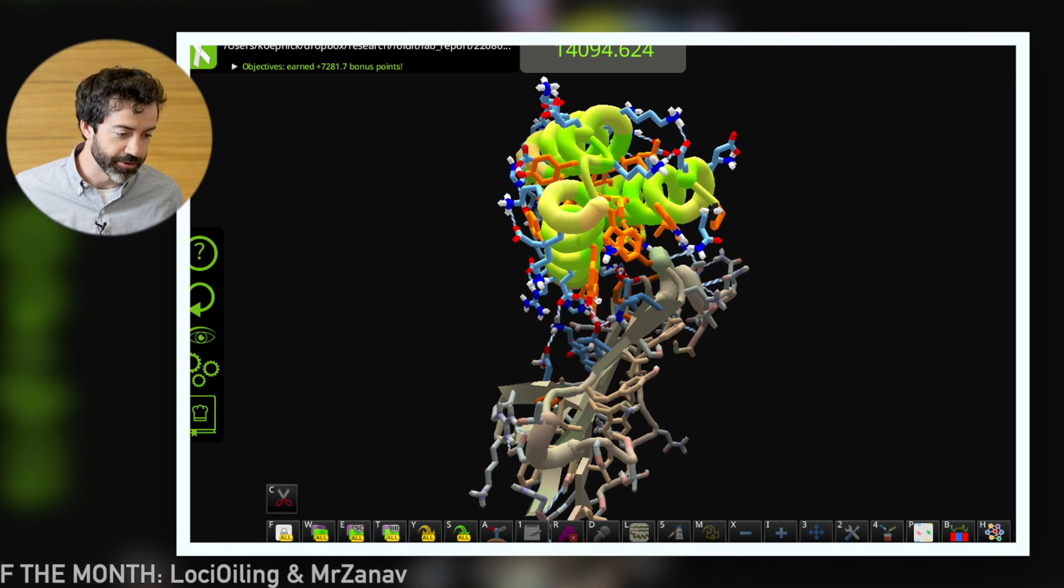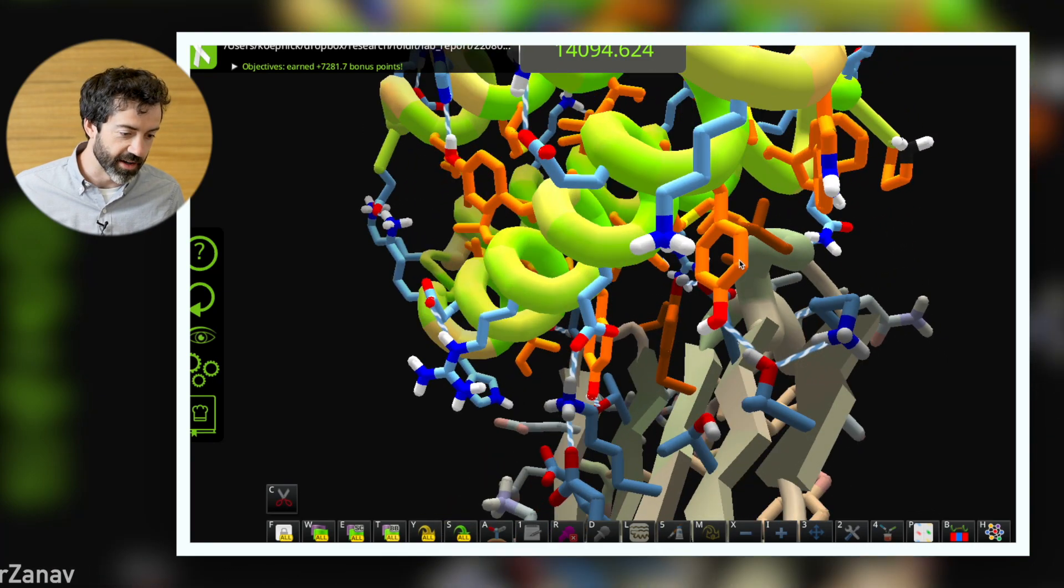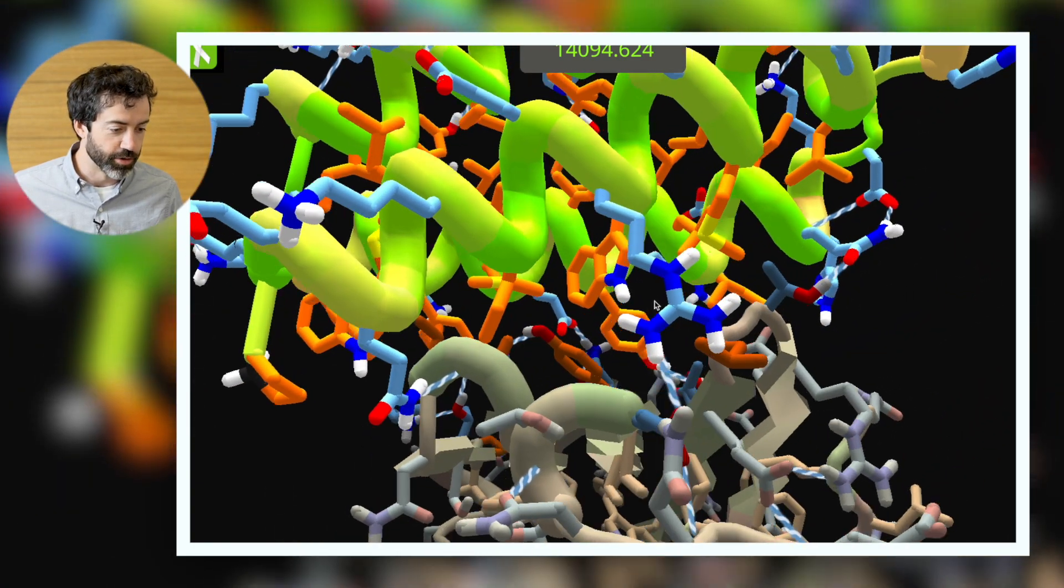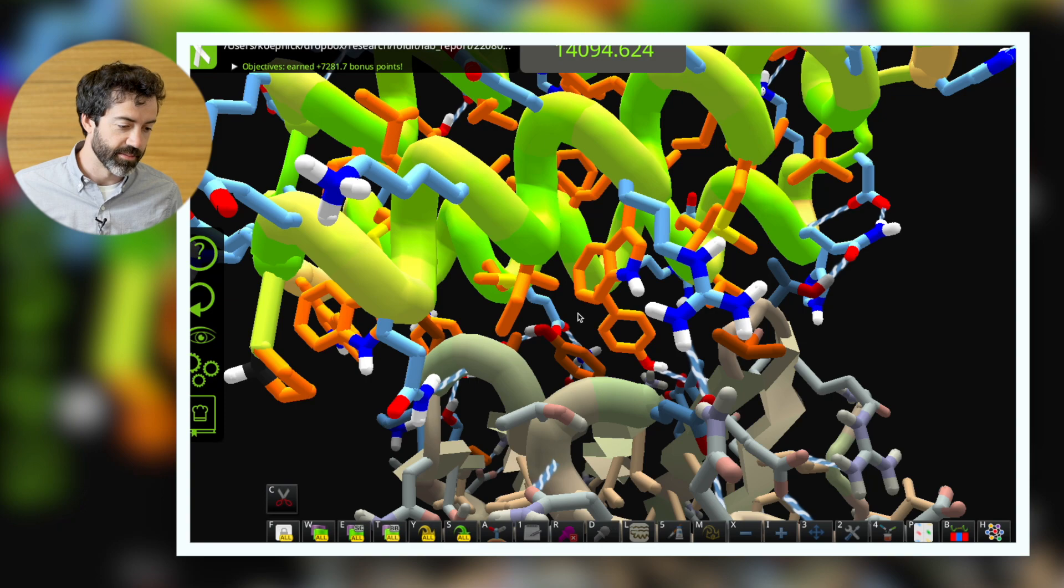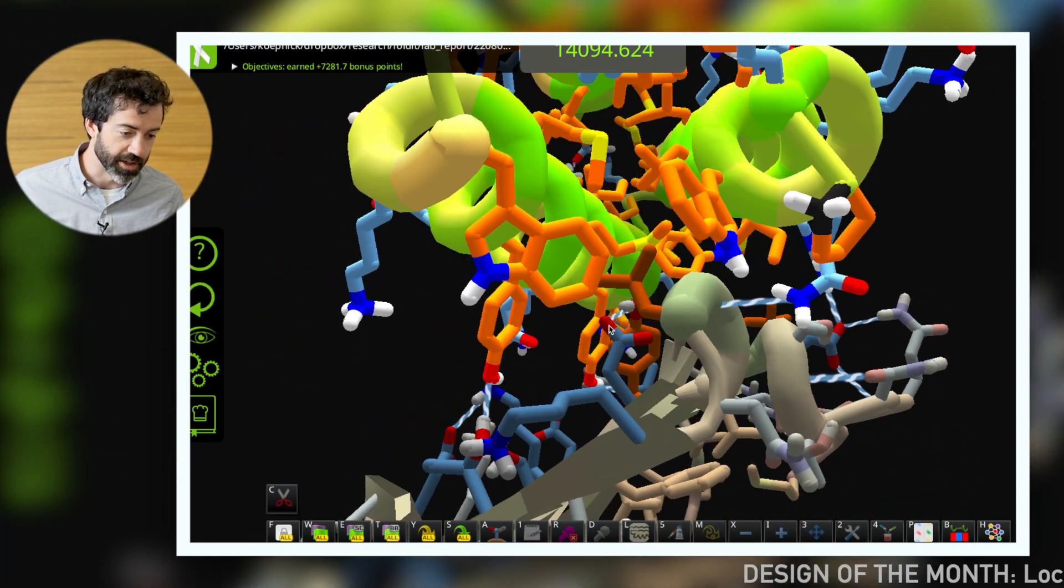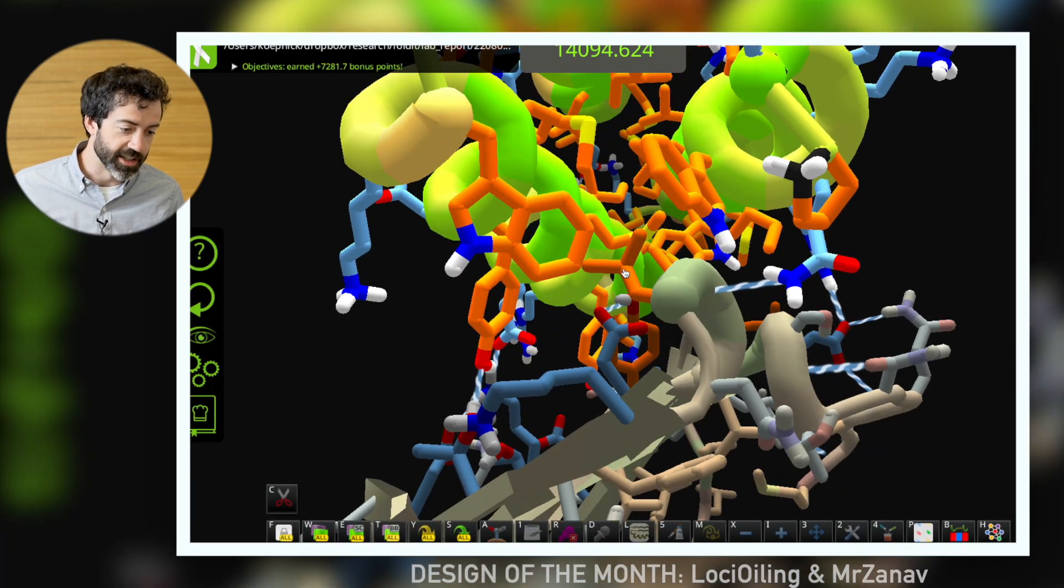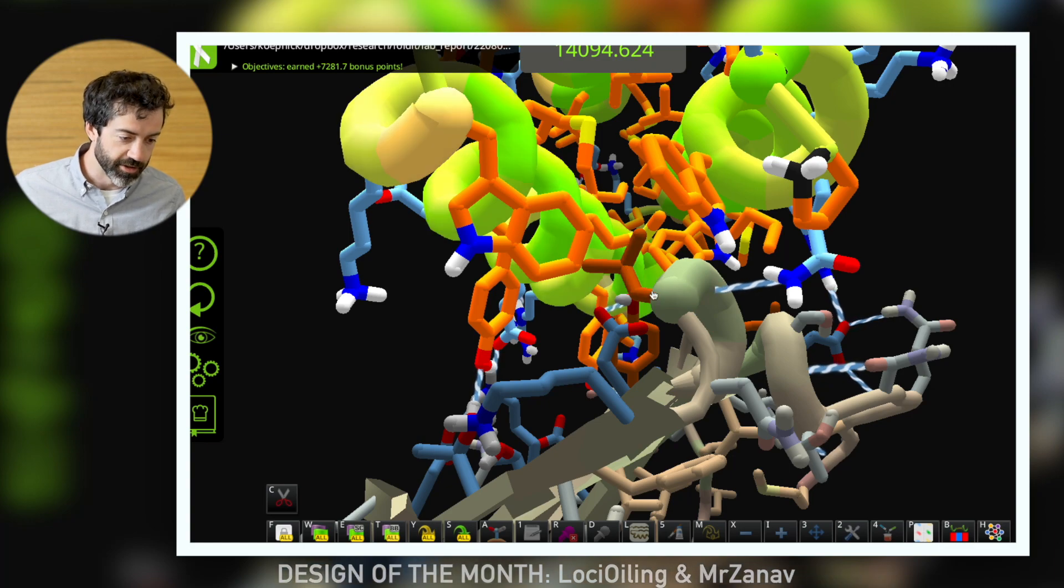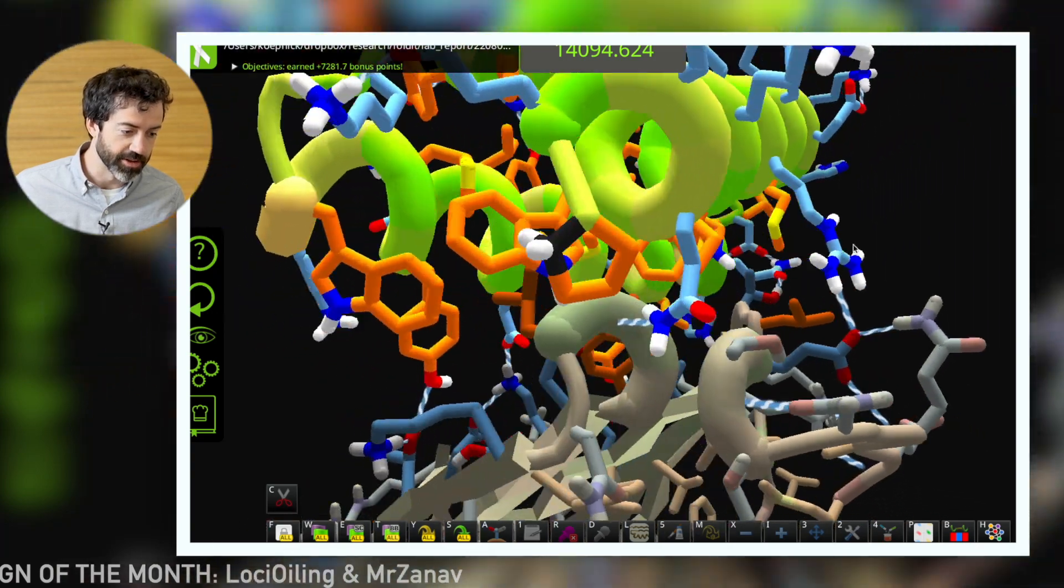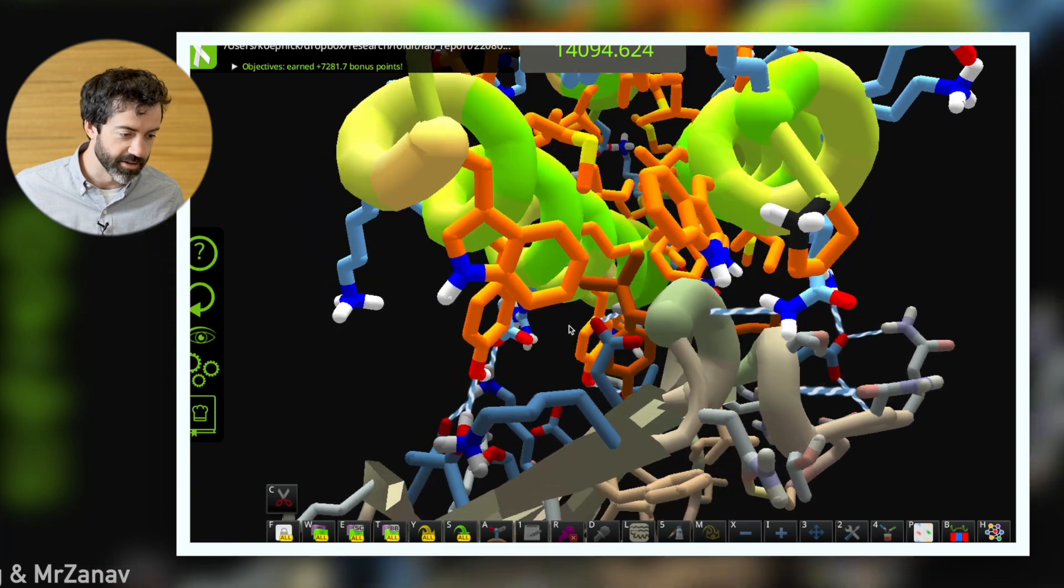However, at the interface, of course, we expect to see some orange hydrophobic contacts because these orange hydrophobics will give us tight binding since they like to be buried and they can be buried when they bind to the target. So this is nice. I like that we are burying this exposed leucine here on the target. That's a nice sticky handhold that we can grab onto and this design makes very nice packing arrangements around this leucine.